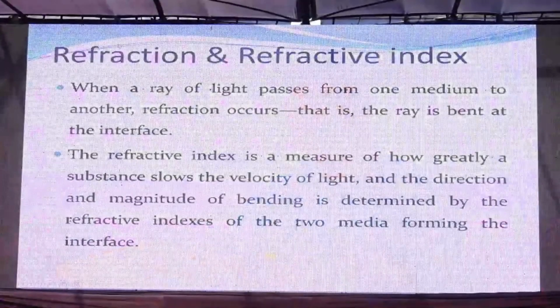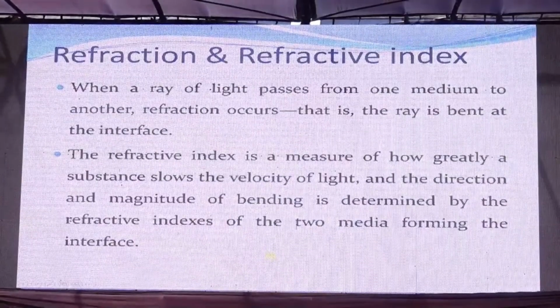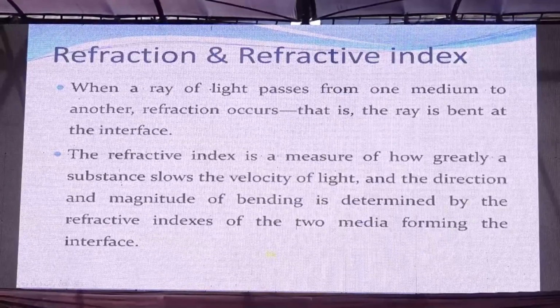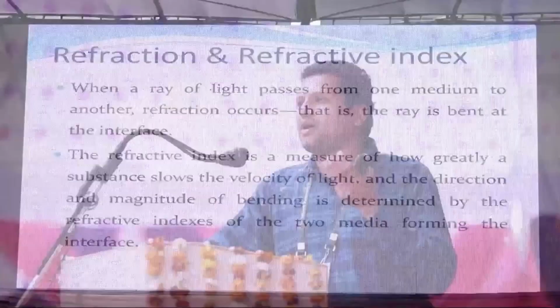Now, the principle of microscopy, what we can observe under the microscope. One of my colleagues usually says, can we observe an elephant under the microscope? People said no. Reason is, sir, it is too big. It is not only too big, but the light will not pass through the elephant. This is the reason. To observe anything under the microscope, light needs to pass.